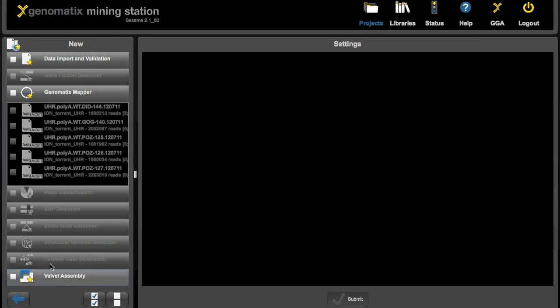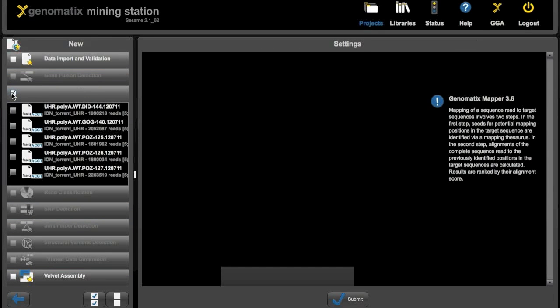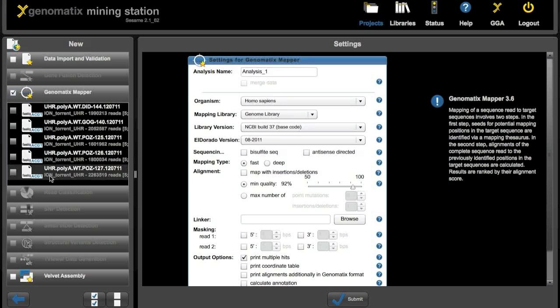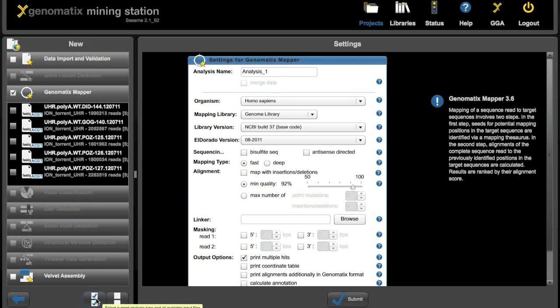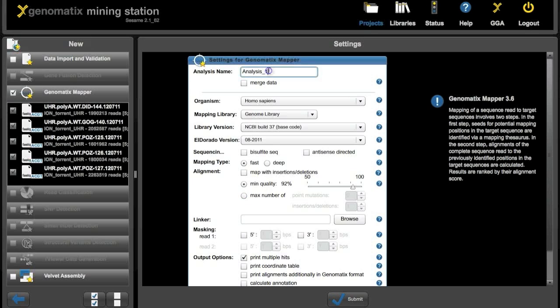Clicking the new analysis button again and then choosing genematics mapper. And then we want to use all the files we just imported. So we can click the select all button down here. Then we need to set the parameters for the analysis.